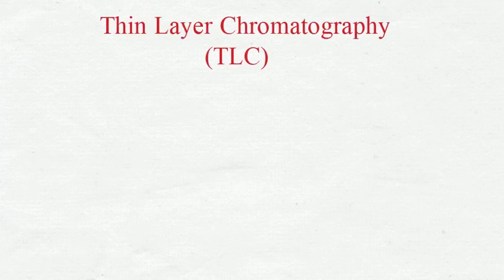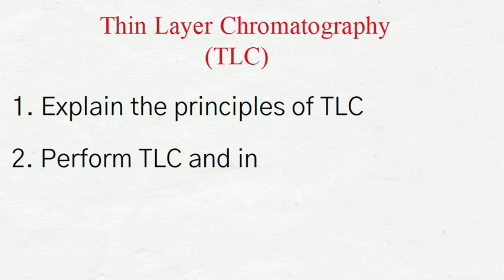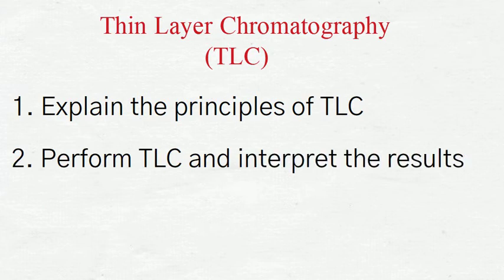In this video, we're going to talk about thin layer chromatography, or TLC for short. By the end of this video, you should be able to explain the principles of TLC as a qualitative separation method, perform TLC for a chemical reaction, and interpret the results.